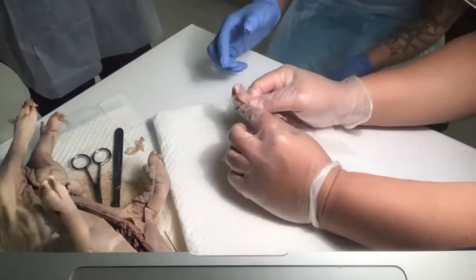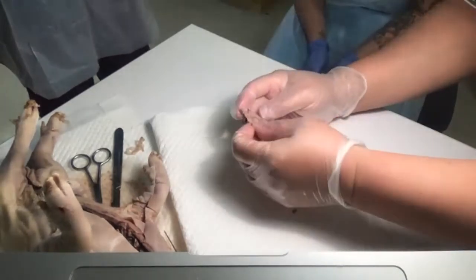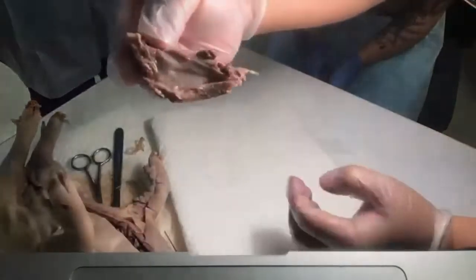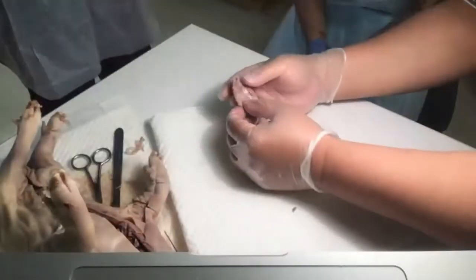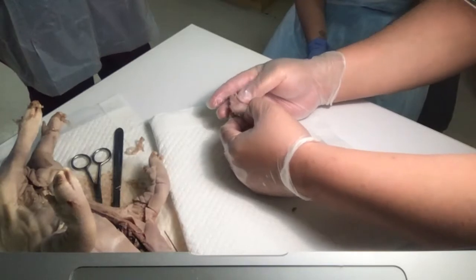It was, right? When it was still attached, right? So the first thing we're going to look for. And of course, look at that fascia. See that fascia with all those... Well, if you were here, you'd see it is all arteries and veins.